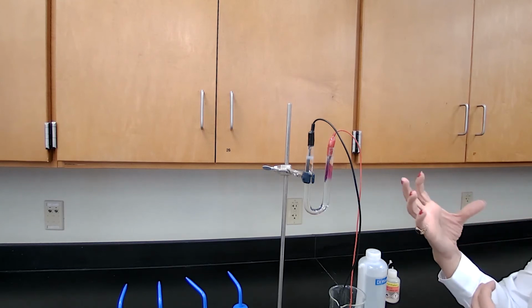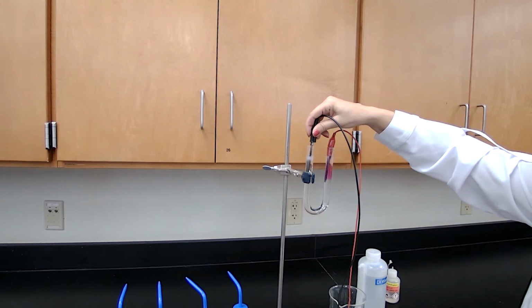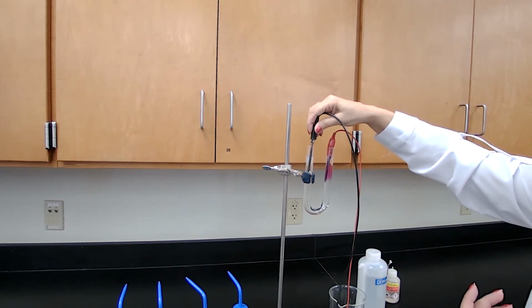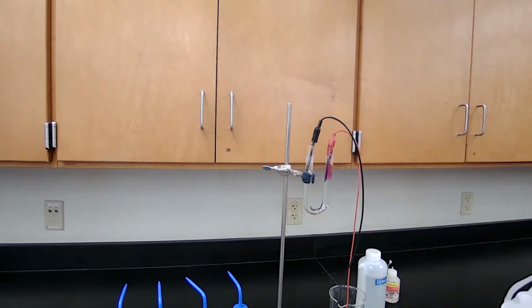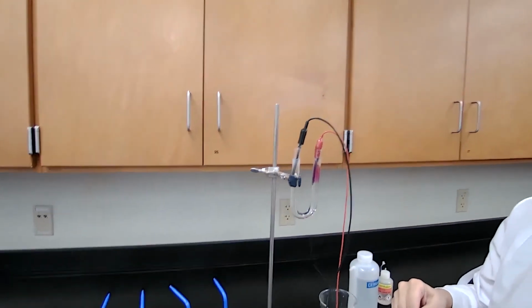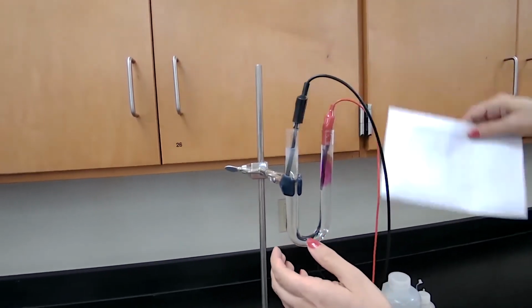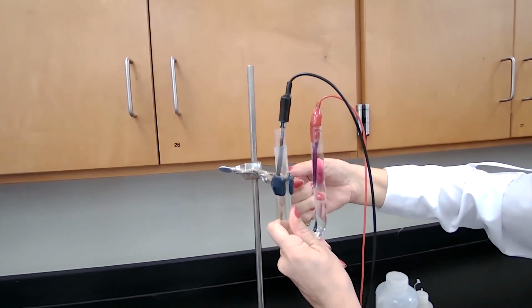I'm just giving some time as I'm explaining, for more bromine to be produced so I could show you. I can see that color right now, but I'm trying to get a little more intensity in the color of the solution, so you can see it via the camera. So either I bring the camera closer, or bring the tube out and use a white background here, and you can see the difference. Maybe I can bring this up so you could compare the color.